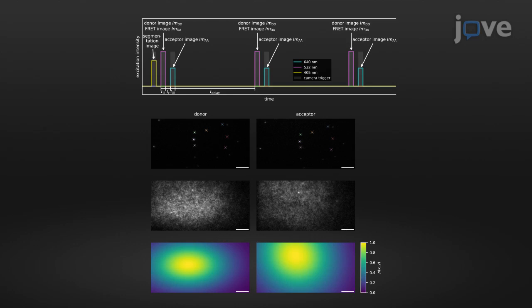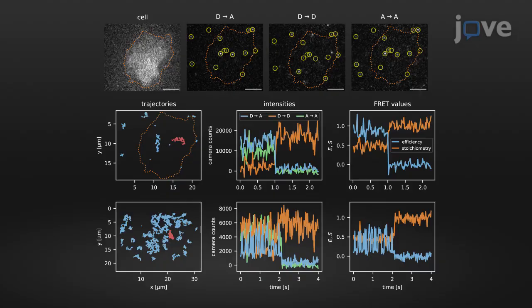Single-molecule FRET experiments using surface-bound probes have been performed almost exclusively on immobilized molecules in the past. However, many biomolecules diffuse and can be analyzed with our method. Combining single-molecule FRET with tracking makes it possible to analyze not only FRET efficiency time traces of moving probes, but also to investigate spatiotemporal aspects such as the diffusional behavior.